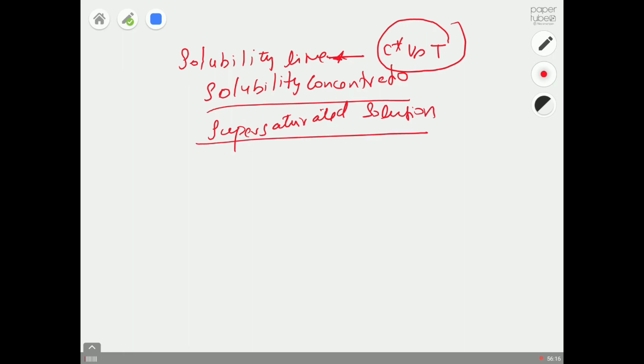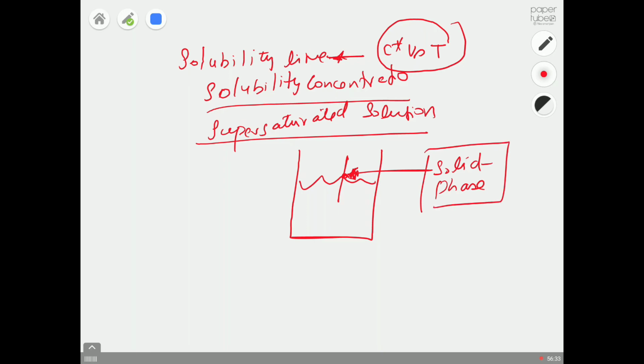And then I said to you, from the simple solubility experiments, we already know that above your solubility limit, the molecules, or your compound, will remain in solid phase. So that's another thing that you learned from this lab on paper maybe, this simple experiment that we are thinking at the moment. If I'm going to do a solubility experiment, I'm going to add some API compound in the solvent, and then I'm going to monitor the concentration, and so on.